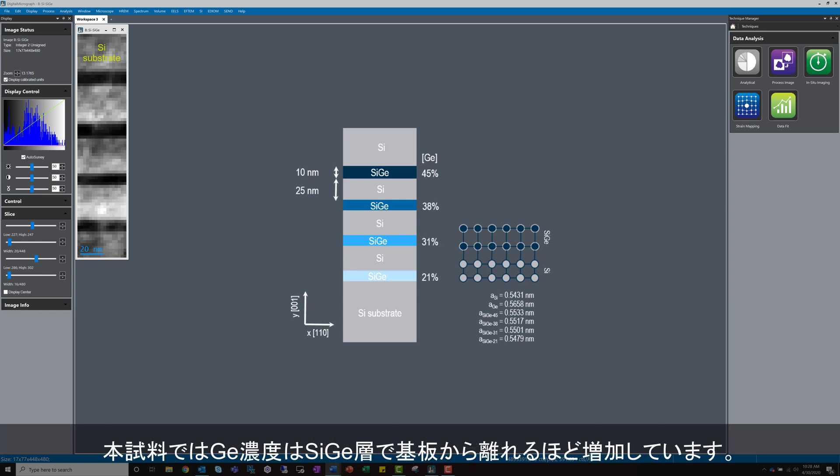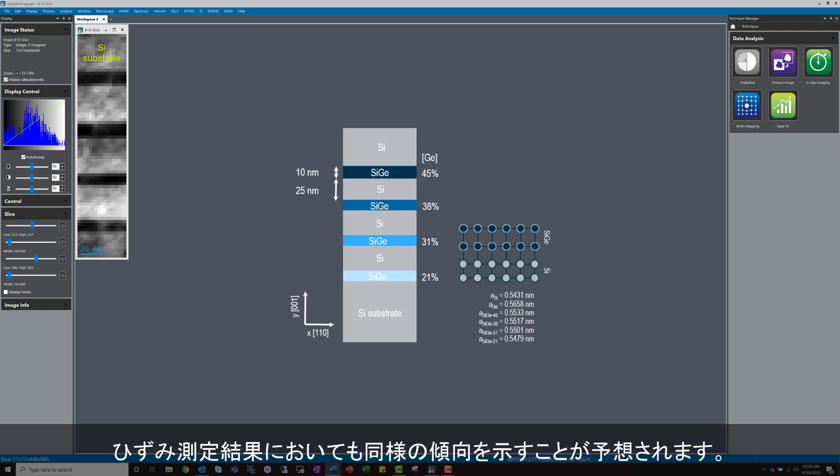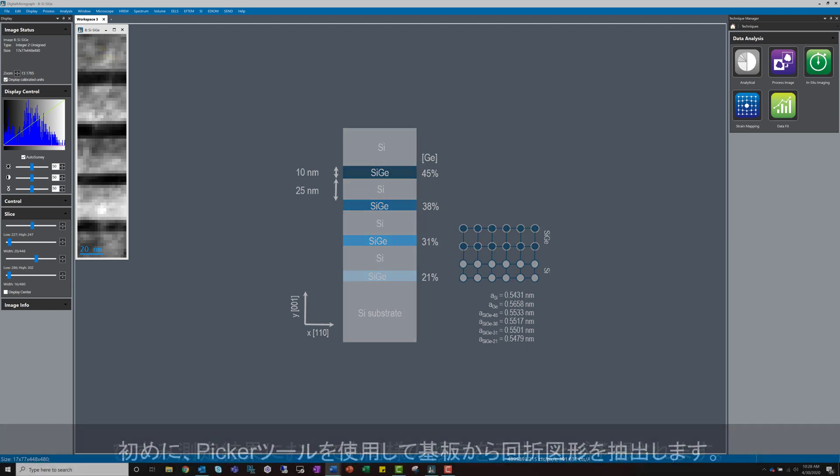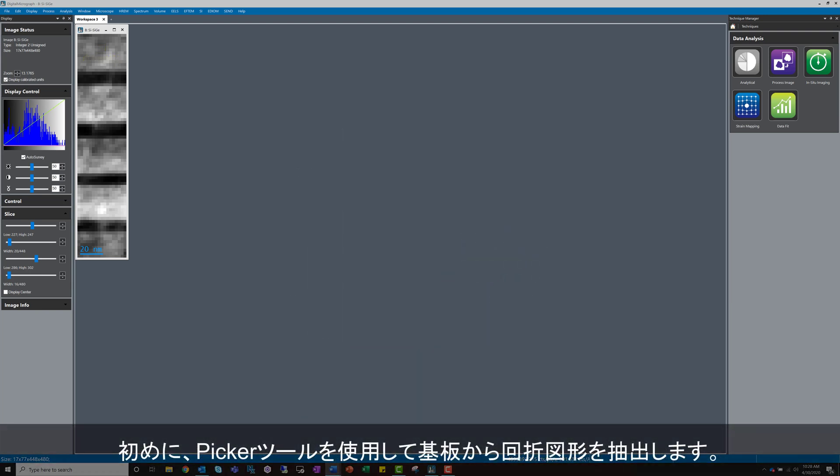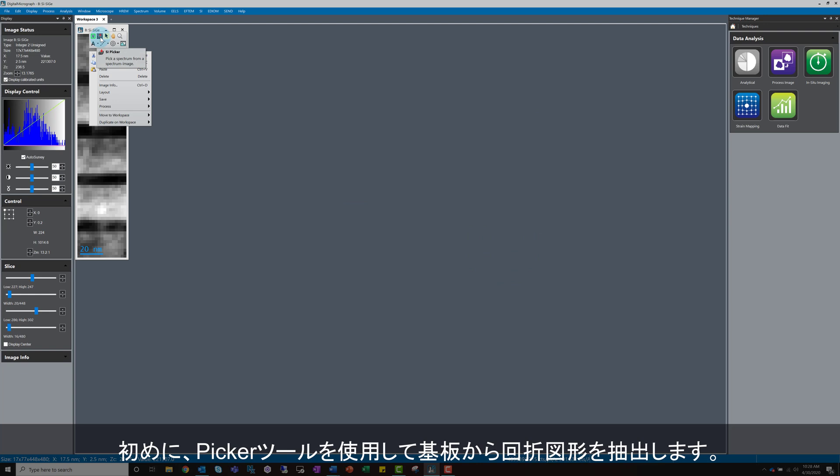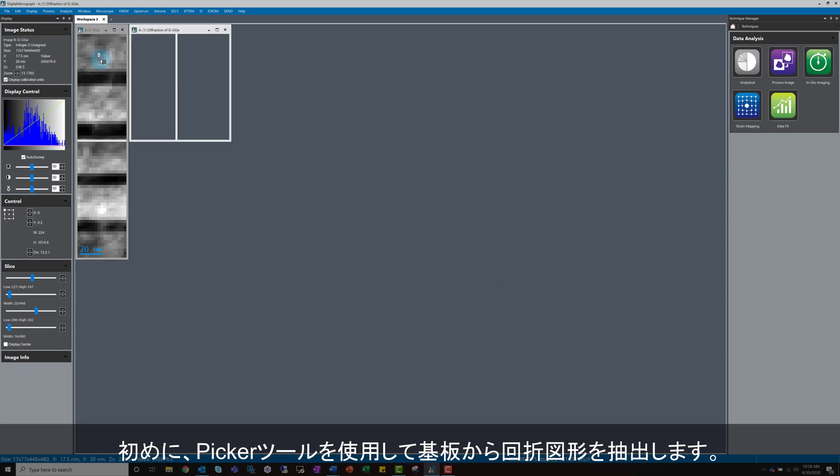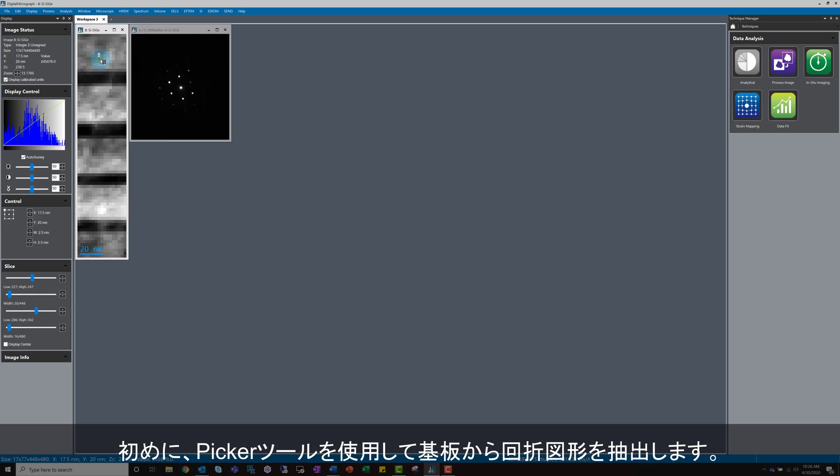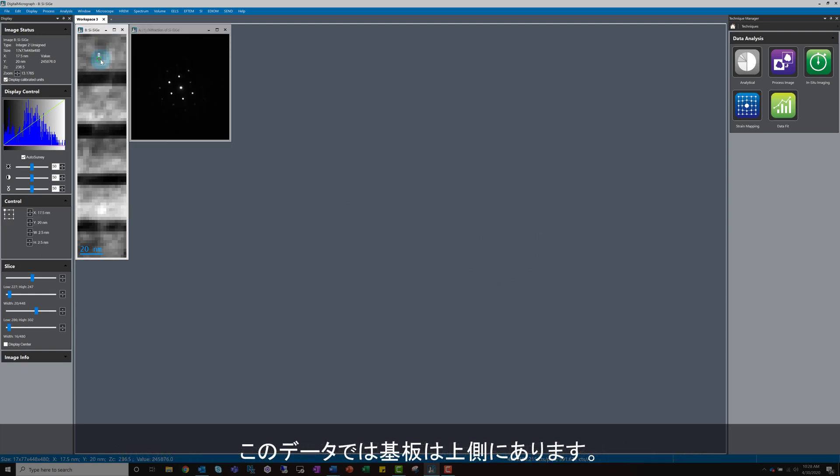In this specific test sample, the silicon germanium layers have increasing germanium concentration as we go away from the substrate, and we expect to see the same trend in the strain measurement. Let's start by looking at a diffraction pattern in this dataset. I'll use the Picker tool to extract a diffraction pattern from the substrate. The substrate in this data is at the top.